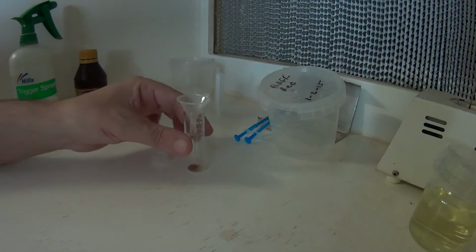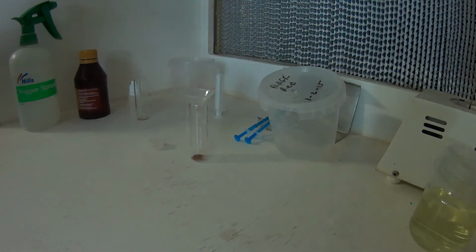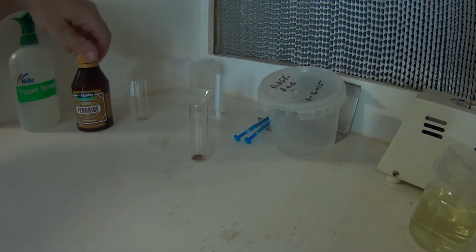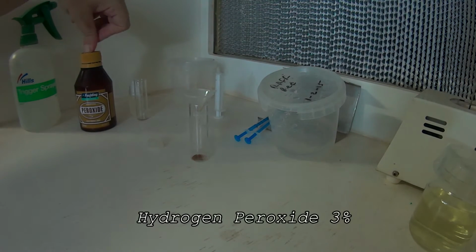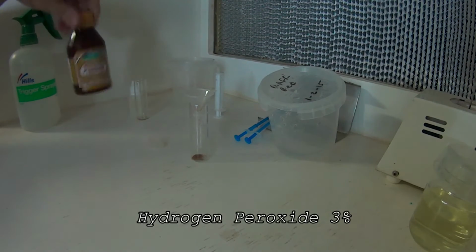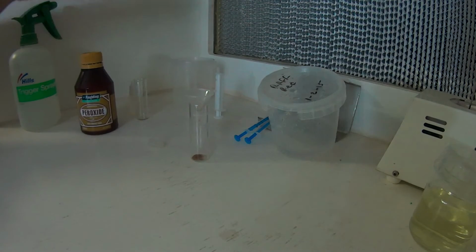Alright, so to sterilize this, I'm just going to use peroxide. It's 3% peroxide. Buy it off the shelf. If you can only get 6%, just double the water. So add water to it, sorry. If you're using 5 mils, add 5 mils of water. If you need to use 10 mils, use 10 mils of water. It's pretty easy to get off the shelf at the chemist. Anyway, if you can, get the 3%. Just makes life a little bit easier.